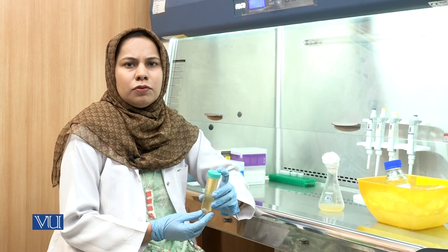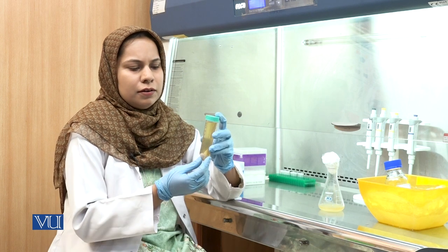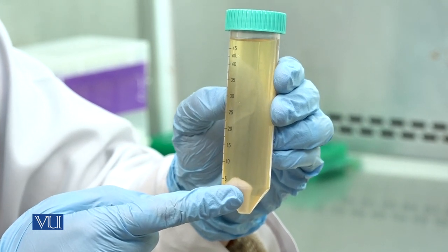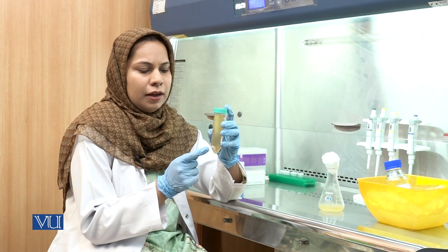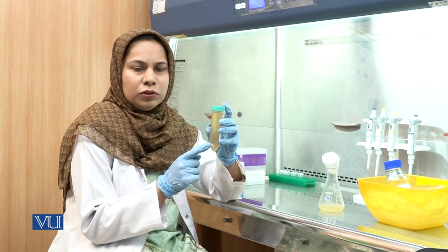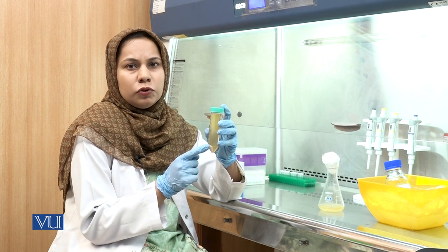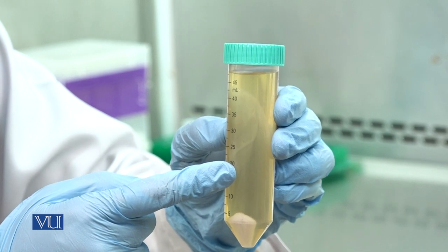After centrifugation of the culture, at 3000 g for 5 minutes at 4 degrees centigrade, we will obtain supernatant and pellet. We need to transfer the supernatant to the discard and we need this pellet. To the pellet, we will add calcium chloride, which is 50 millimolar solution, and this should be ice cold. The centrifuge tube as well as the solution should be ice cold.